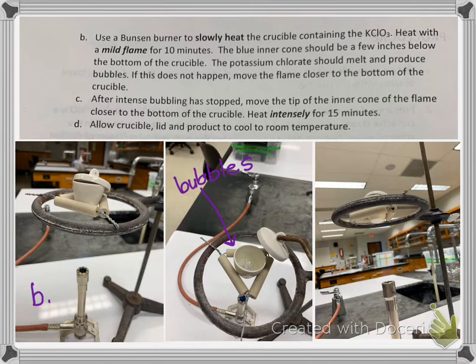Once the bubbling subsides, on letter C, I heated it again for 15 more minutes. I took this picture showing you that I was heating it very intensely. The bottom of the crucible was starting to turn a little peach color. So after the intense heating, I took the crucible and cover with the products left in it and set it to cool.